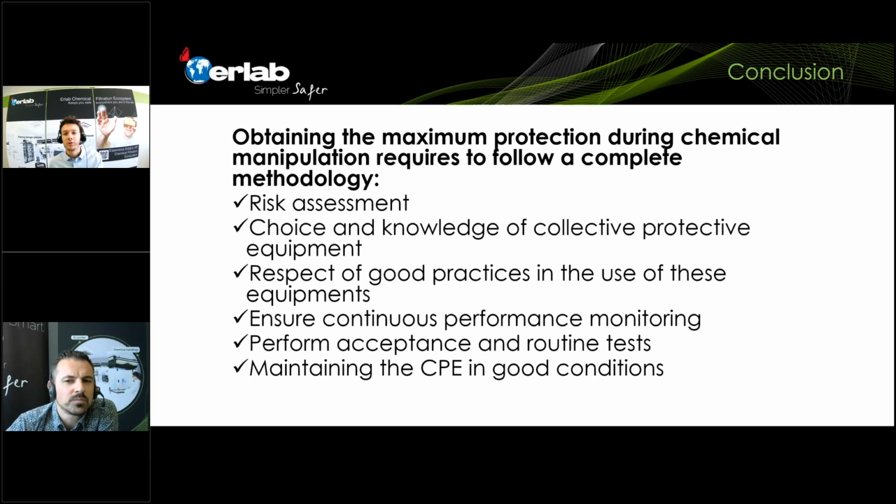Of course, I've shown on one of the slides what the procedure is in order to test the efficiency of activated carbon filters. So it was mentioned that it's with hydrochloric acid that we're going to test the activated carbon filter. However, when we sell a fume hood to one of our customers, we always recommend them to do a test with acetone, because acetone is very volatile. It's a chemical that we find in most laboratories. It's very volatile, so there will be chemical vapor straight away, and we can test it easily by using a colorimetric tube or by using the sensor, which is also in place in the fume hood.